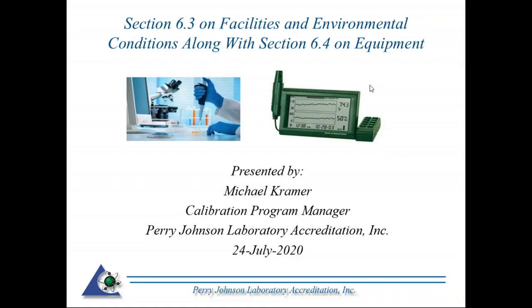We will be presenting today on ISO 17025:2017. We want to take a look at the requirements in Section 6.3, which is the facilities and environmental conditions, be it in your fixed facility, at customer site, or perhaps even a mobile facility. And we're going to also look at Section 6.4, which is the section on equipment.